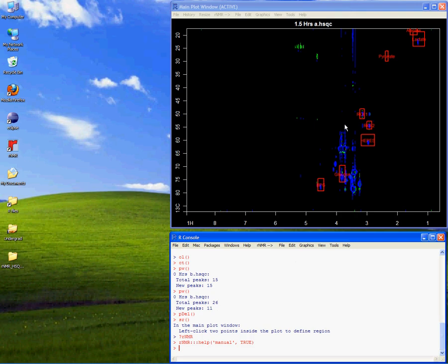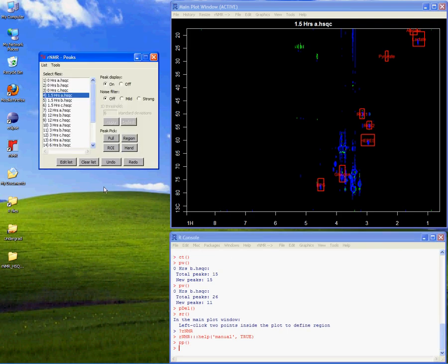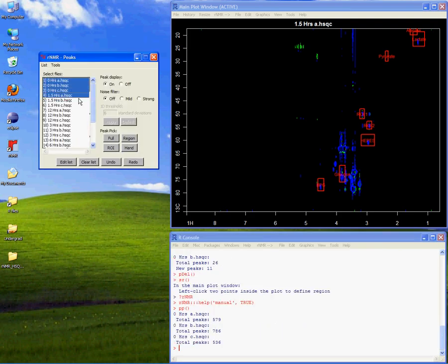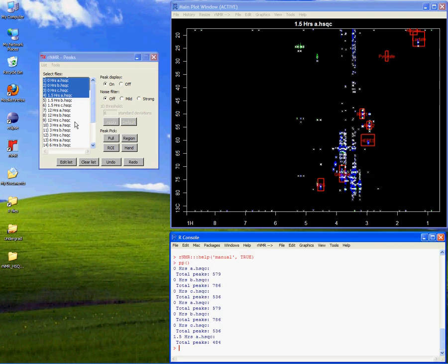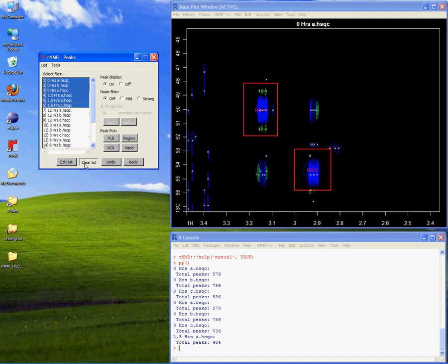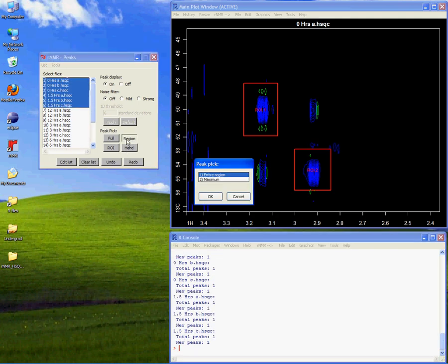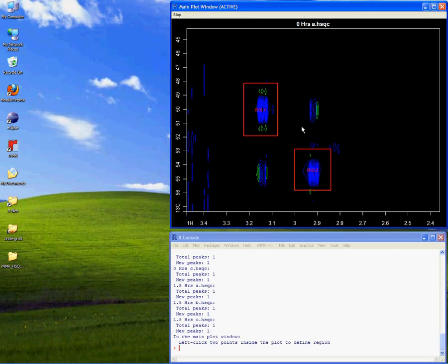In addition to the unique features I've mentioned, RNMR also includes the standard tools common to most NMR data analysis software. Although the focus for peak assignment in RNMR belongs to the ROI feature, traditional peak picking functions have not been overlooked. Several peak picking options are available, complete with RNMR's customary emphasis on batch operations and usability.